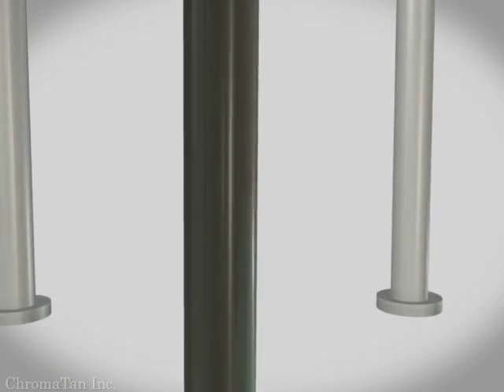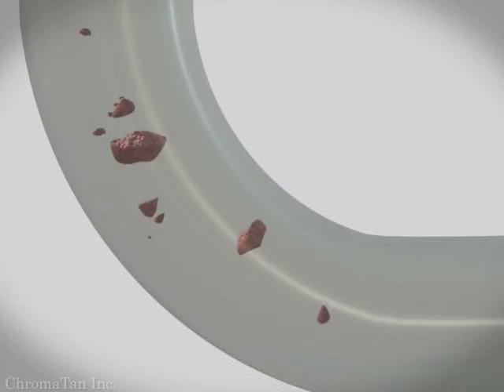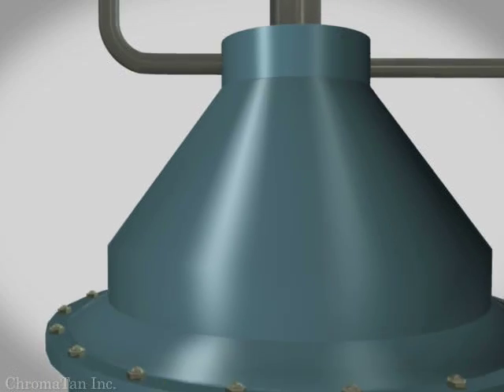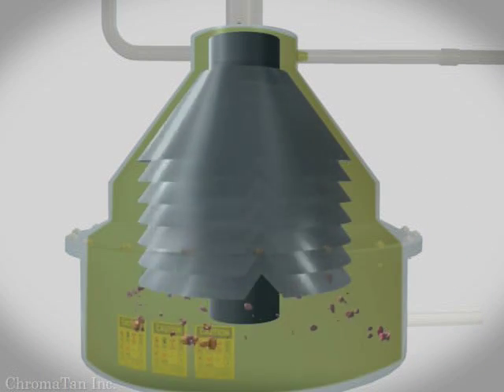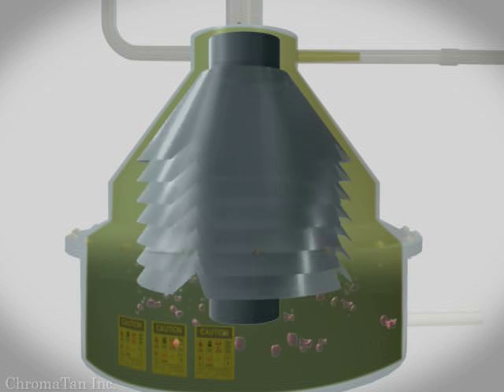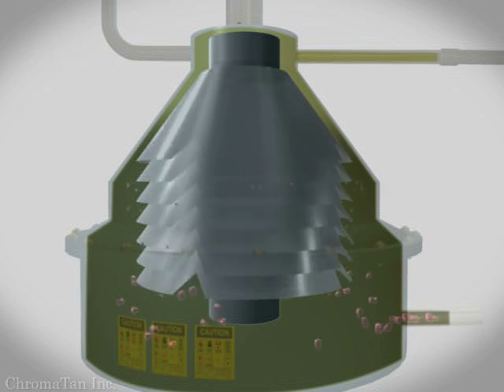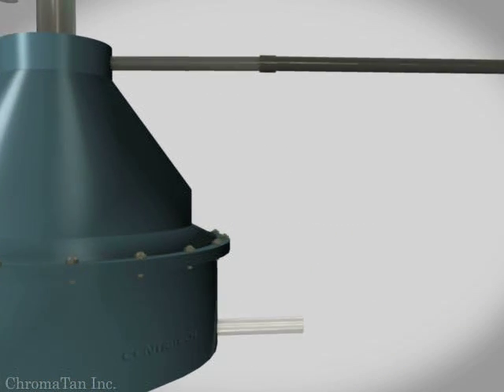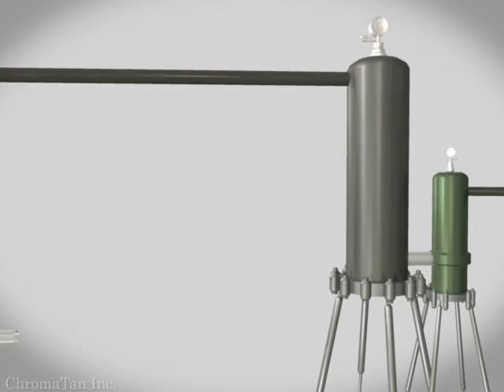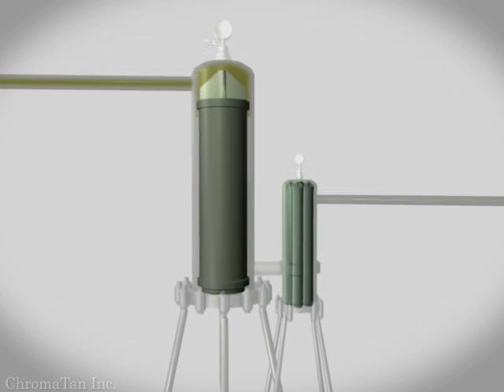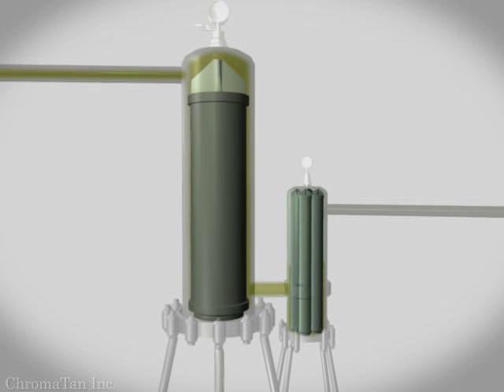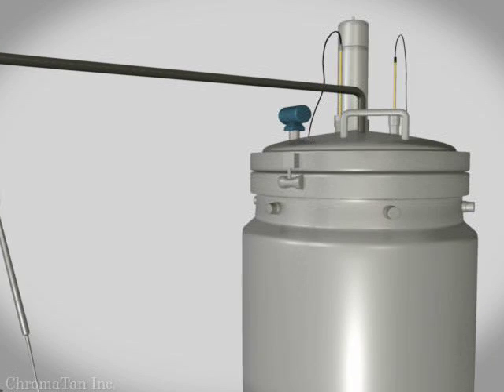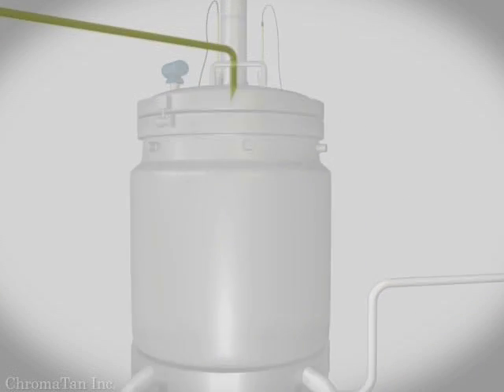The purification process consists of a number of process steps. The first step is designed to separate whole cells and large cell debris from the bioreactor broth, typically performed with a centrifuge. The clarified broth is then polished further by filtration steps designed to remove the smaller cell fragments. The second filter element usually employs a 0.2 micron pore size sterilizing grade filter, with the harvested broth collected in the holding vessel for further processing.